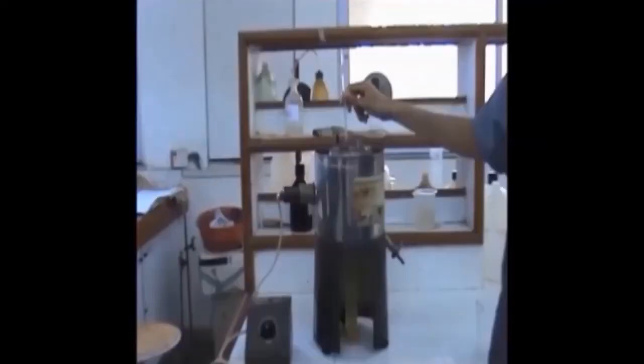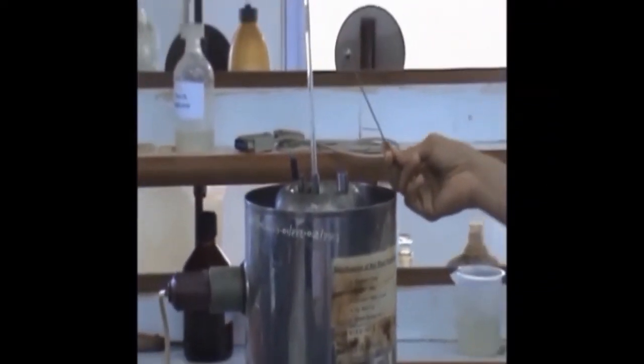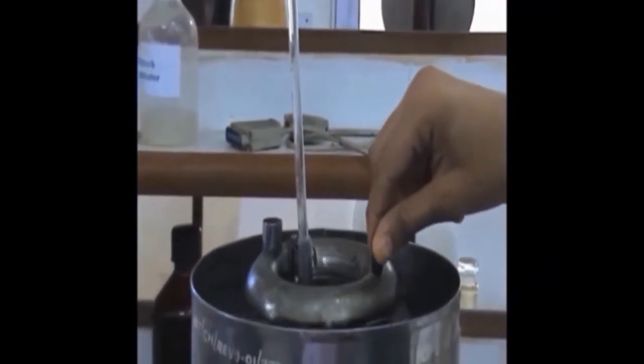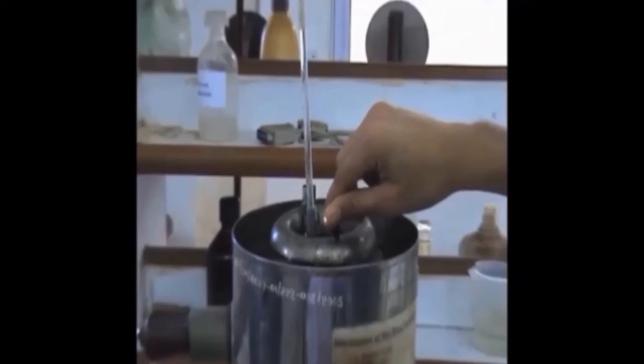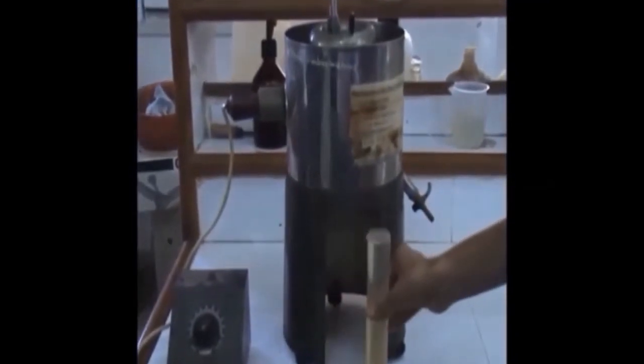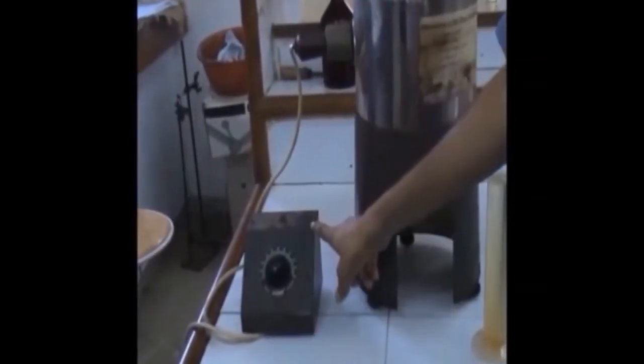Then we have the stopper for the little hole at the bottom of the vessel holding the lubricant. We need to keep stirring the water of the water bath continuously to ensure uniform distribution of heat. At the bottom, we have the measuring cylinder to collect predetermined equal quantities of the lubricant that flows through the orifice. The source of heat here is an electric heating coil and the temperature is controlled by this regulator.